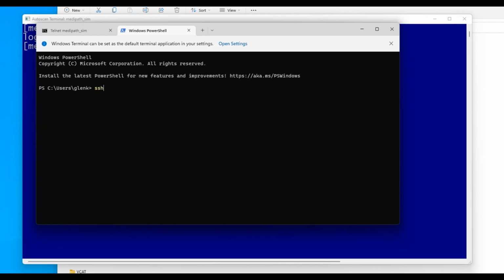So you go ssh-keygen, and that'll generate a private key. Now we'll see that it's trying to generate the key into the .ssh folder, which is good. That's the place we prefer, and it's also using the default name of id_rsa, which is the default private key for a user in SSH. So we'll just accept that default.